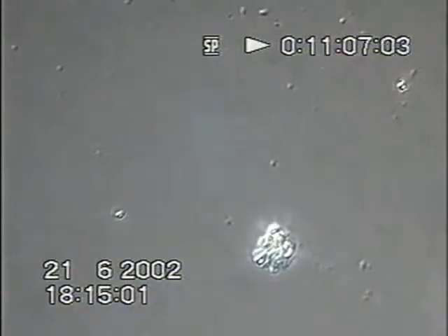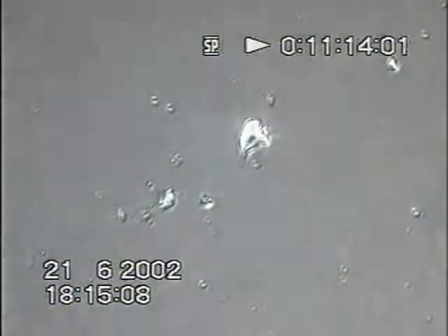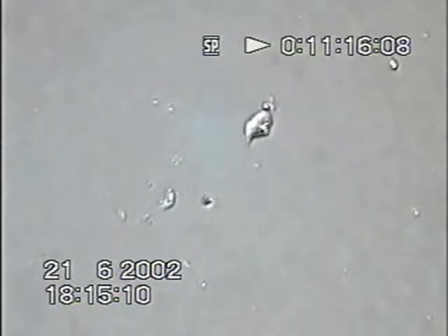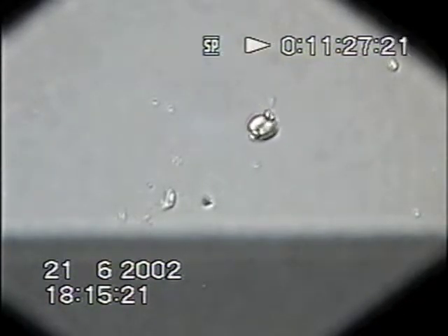This is all debris. Another scooter. Oh no, what's happening here? Good gracious. Are they attacking it? It's almost like that.